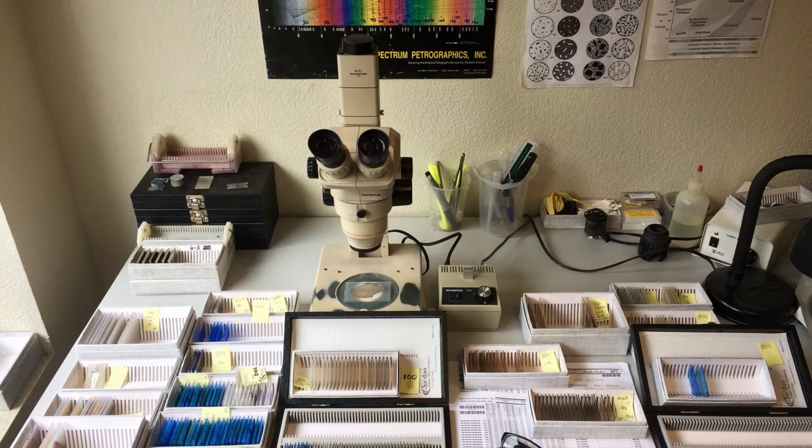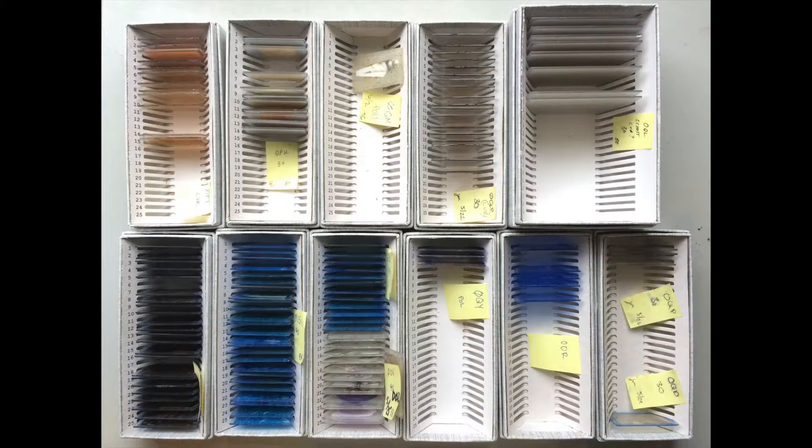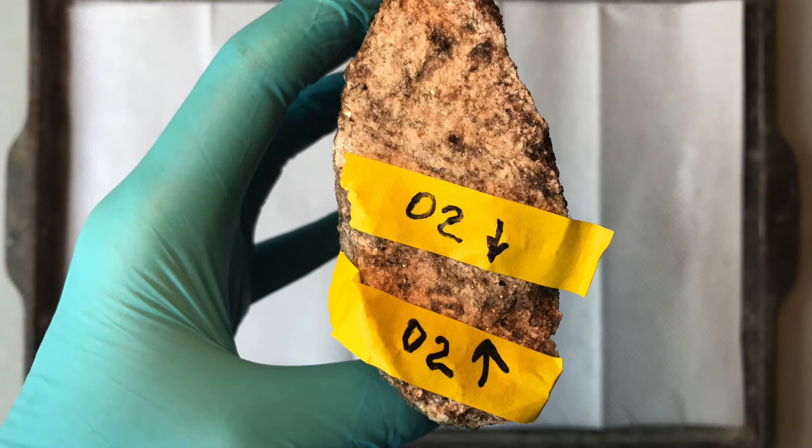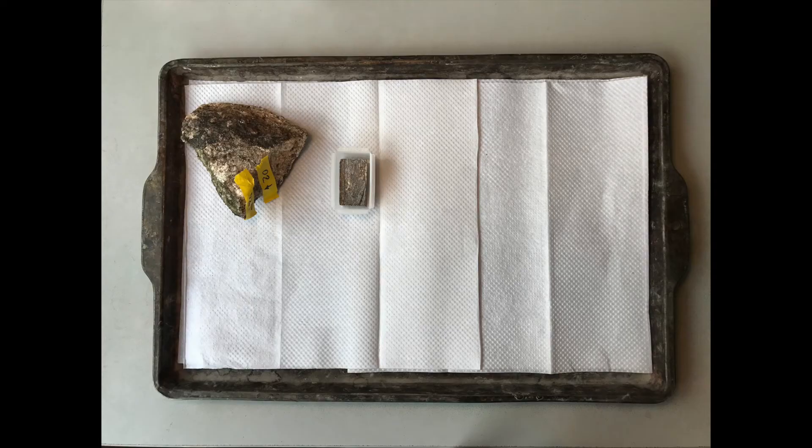Many of the samples we receive undergo this exact treatment, although there can be variations based on individual sample characteristics and special analysis requirements. The essential elements of preparation remain the same. Thanks for joining us back in Spectrum's lab as we turn samples like this into thin sections like this.